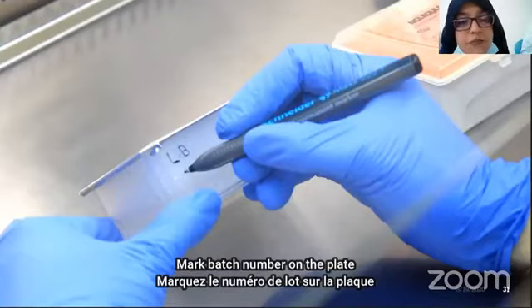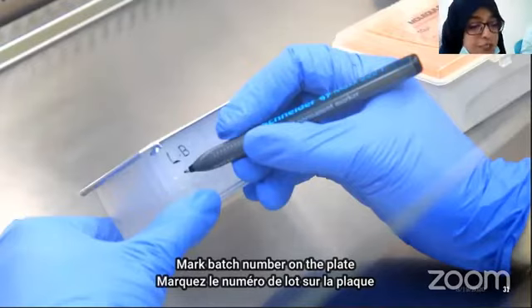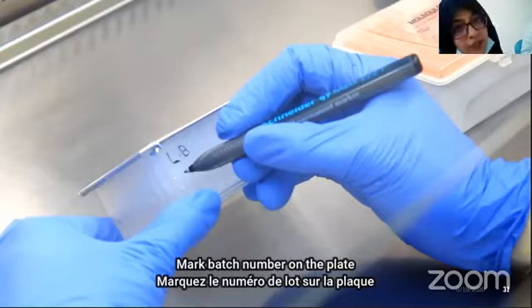If we have only 12 or 13 samples, we do not prefer to use the deep well plate, which is based on 96 wells, and all the consumables are very expensive. So we prefer manual extraction, but the same samples can be used on the automation machine as well.